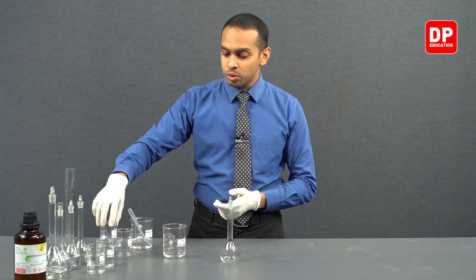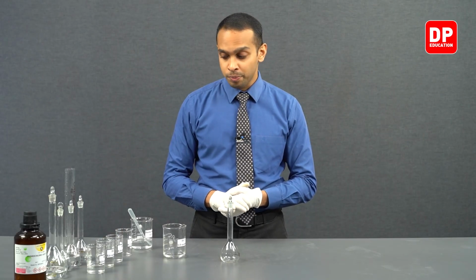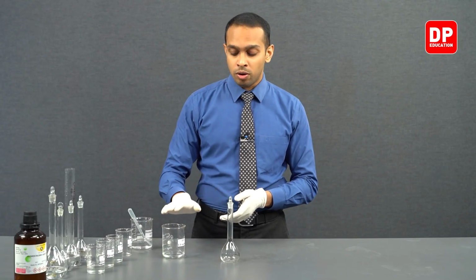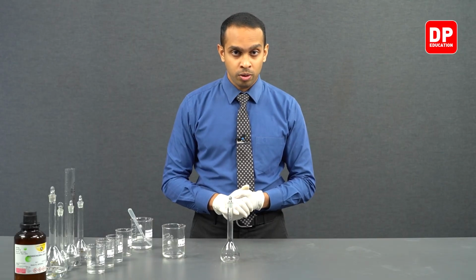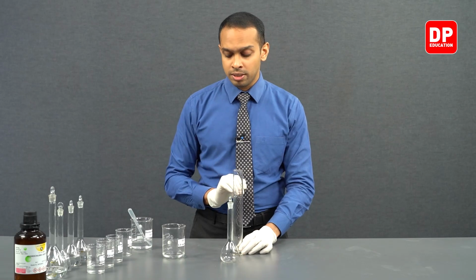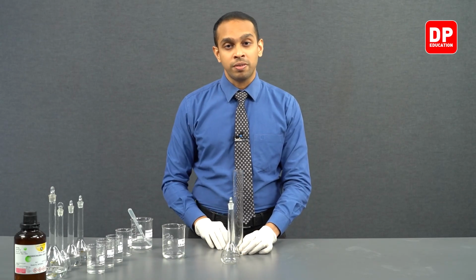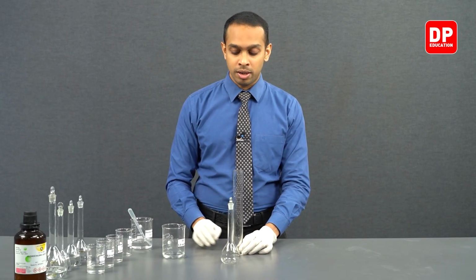But to keep the consistency of what we were doing so far, we will be taking 20 milliliters of our 1.0 moles per decimeter cubed concentrated HCl into a measuring cylinder, and then we are going to transfer that into a volumetric flask here and fill distilled water all the way up to the calibration mark.